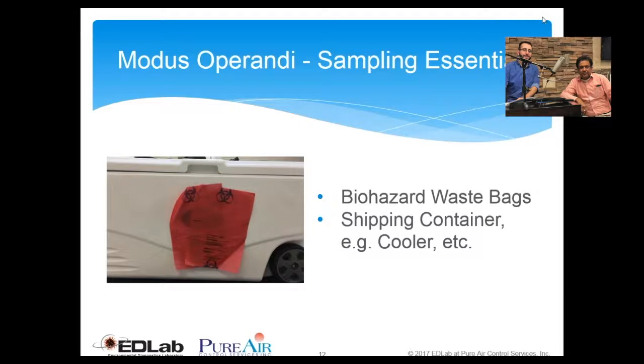It should be properly marked because you never know if the sample you are collecting has some Legionella in it or other concerning pathogenic species or some other biohazard situation. So it is always a good idea to carry some of those red bags. As you can see, I put this little small bag having a biohazard sign so that you can properly dispose of those bags as per the local, state or federal regulation.